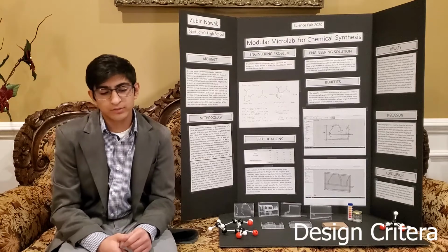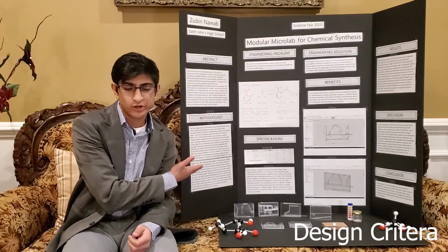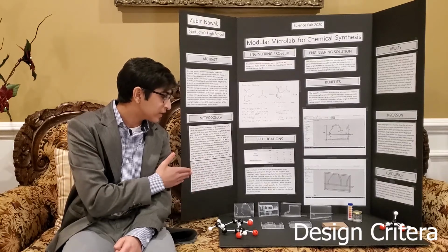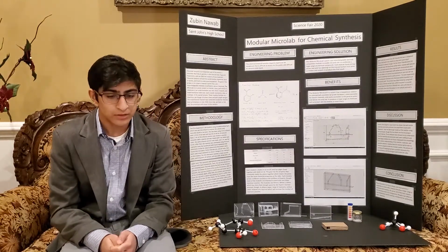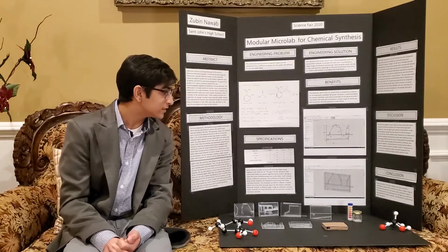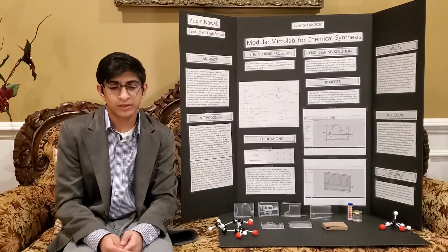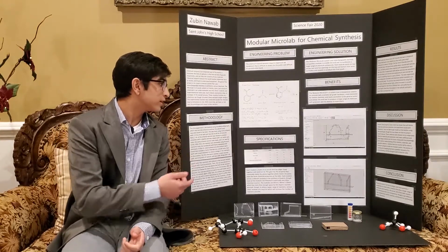As the MicroLab is going to be a substitute for lab equipment, it's necessary to compare those two in the design criteria chart. So I compared the MicroLab, lab equipment, and home equipment to modularity, ease of access, price, and usability. I wanted to make a physical prototype. So I used a case study involving the synthesis of acetylsalicylic acid, which is this compound right here, which is actually aspirin. The goal of this case study was to make the modules able to synthesize aspirin just by adding these two reactants, salicylic and acetic acids.